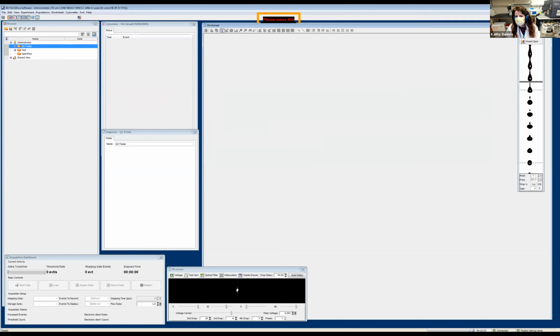So we're giving you an overview today of how to do the setup, and it's not considered a full training, right? Because there's so much more involved when we're talking about the fluidics. You can see right behind me there's another ARIA. We have the waste, the ethanol, and the sheath. It is very involved, and this partly goes back to Svetlana's logistical question.